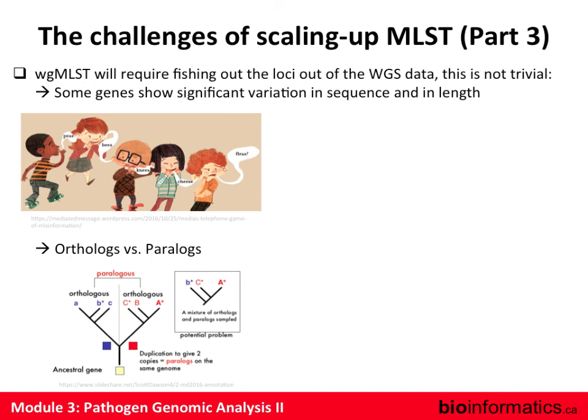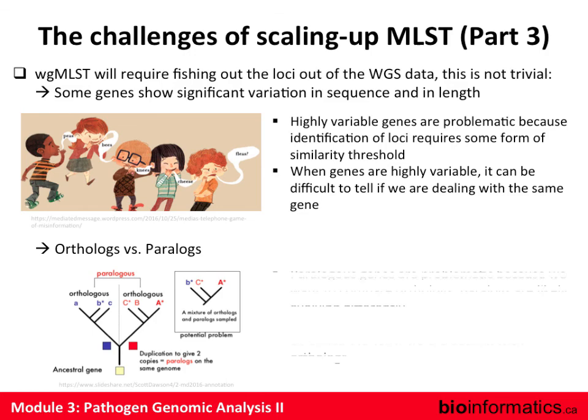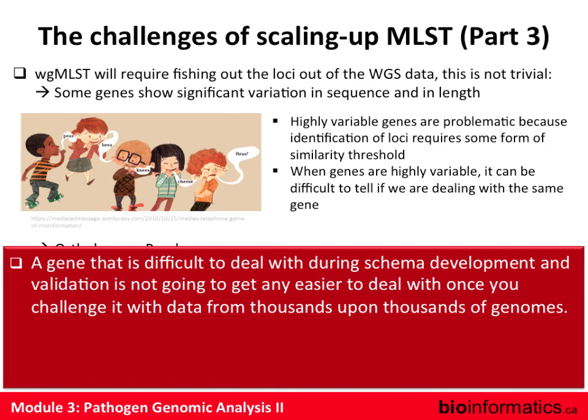And so, in the words of Gary, if it's a problematic guy, maybe get rid of it. Even though SNV analysis and MLST analysis are quite different, at the end of the day the one guiding principle that is the same is: if it's a troublemaker, get rid of it, because you cannot deal with that. Okay, next slide. So if a gene is problematic, get rid of it.